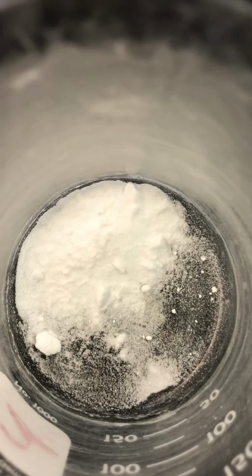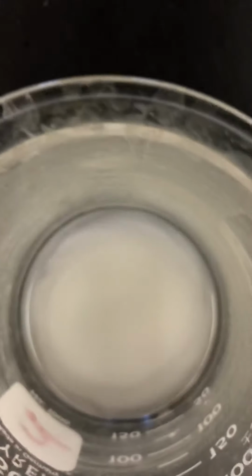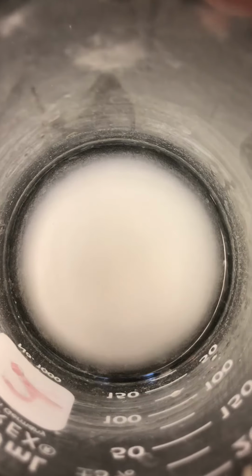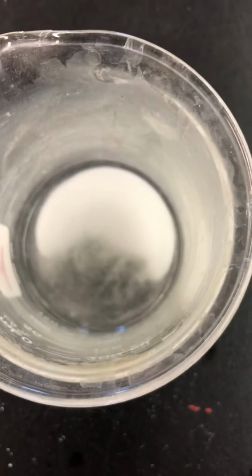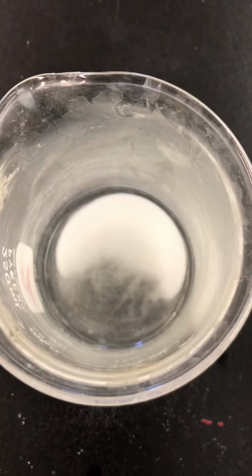Okay, so this is solid 2. We're going to add water. Let's take a look at it from the side. Look at it again. And again, if the majority of solid is still there, it would be considered insoluble. Okay, let's move on to solid 3.